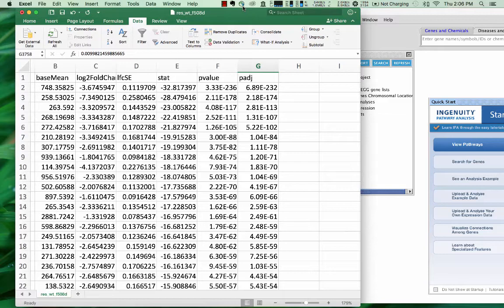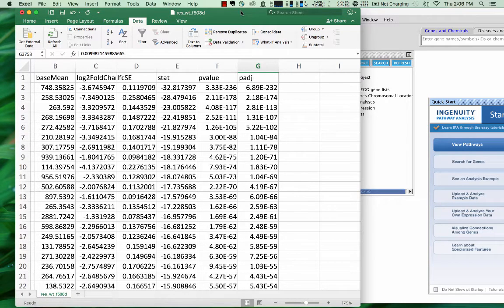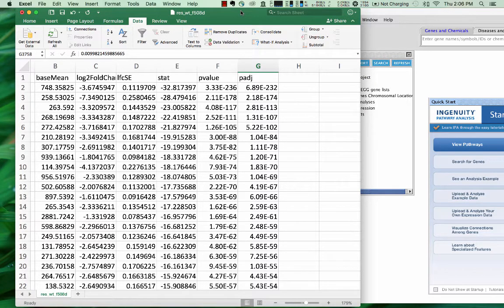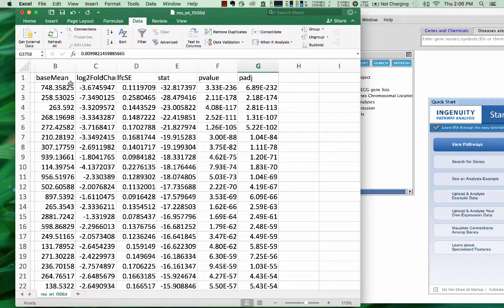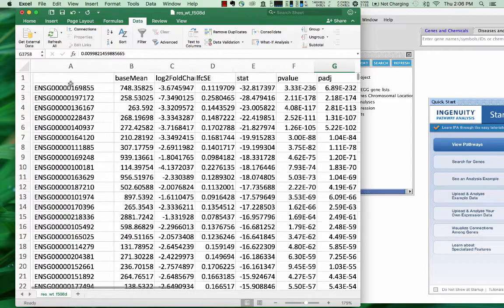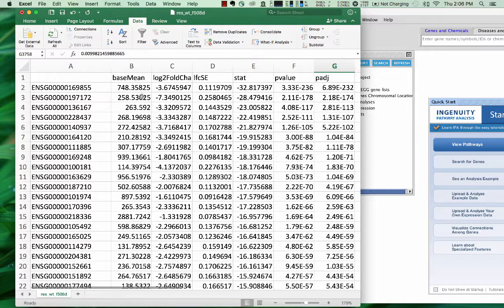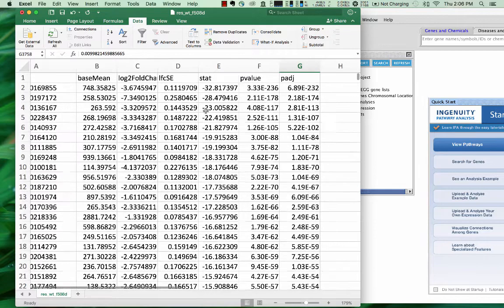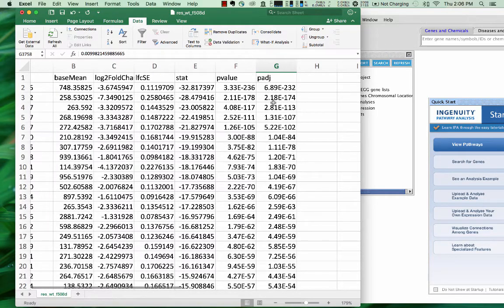I've got some data here in this Excel sheet, and this is RNA-seq data. It is coming out of RStudio and is differential expression calculation. So you can see we've got an Excel sheet with some columns that have data in them. We have the ensemble gene IDs in column A, the base mean values, log2 fold changes. Over here, we have an adjusted p-value, which is a false discovery rate.